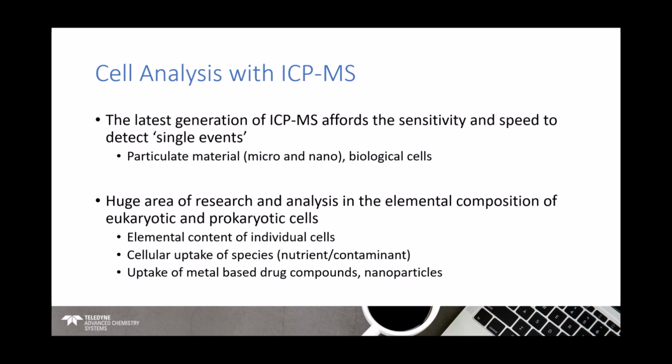Because ICP-MS can now capture data for this kind of sample, it's now been brought into broader study on biological cells.